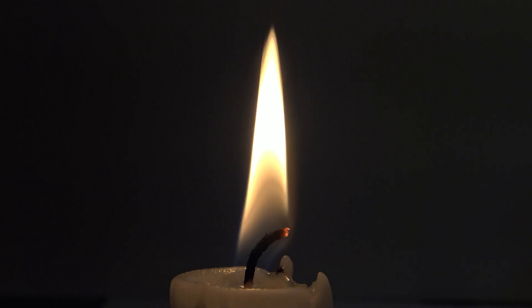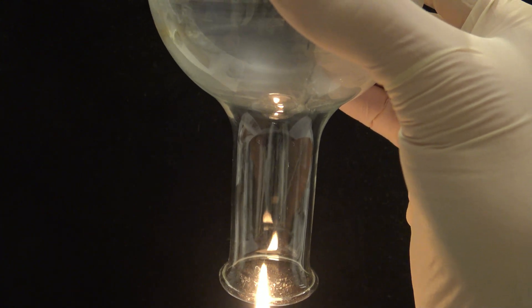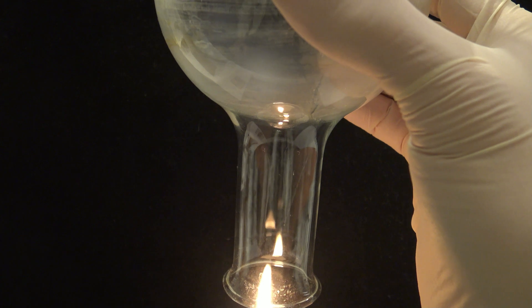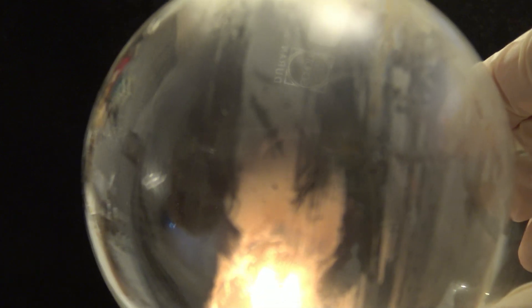To show one of the products from the combustion of a candle, a round bottom flask is held above the flame. On the inner surface, water condenses, which is a product of nearly every usual combustion.